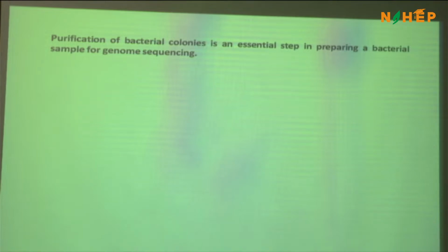All right, remember, microbiological purity is first. It's quite easy to do. Mostly it is through morphotyping. Two different bacterial species on the same plate, you can segregate them just by visual observation, right? For example, firmicutes and pseudomonas, you can very easily differentiate. Bacillus, most of you who are working with Bacillus know how Bacillus looks. You can segregate them. There is no problem on that.